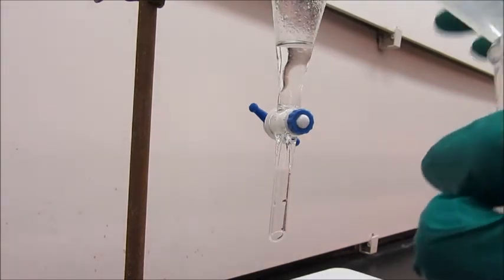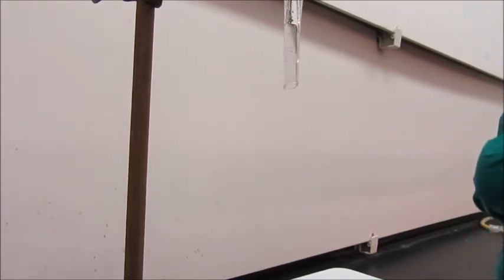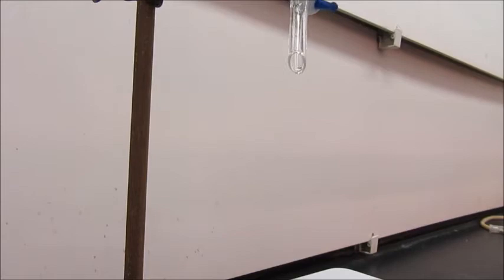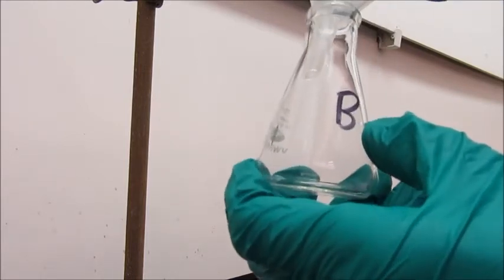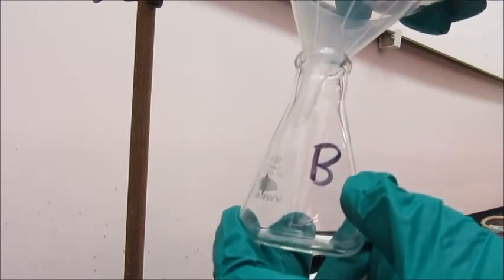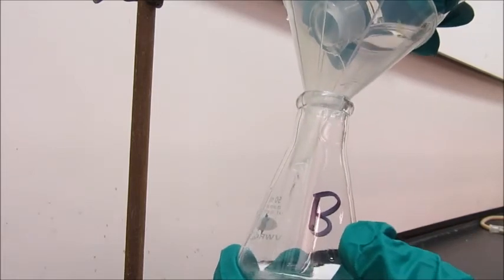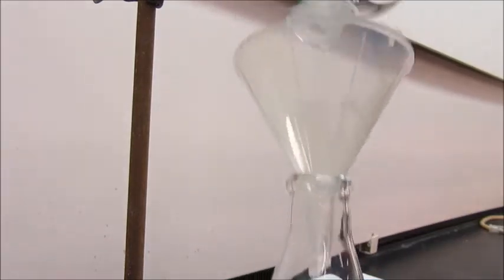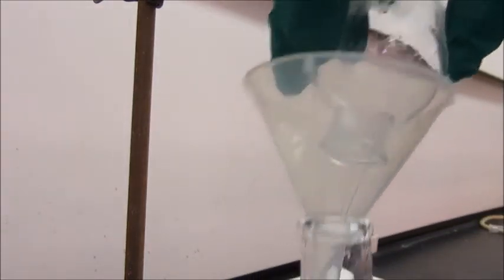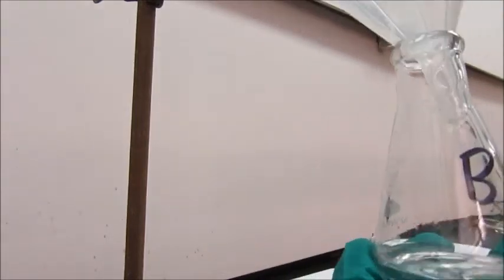And now I'm going to put the residual, the top layer, if I can get it out. I'll put the top layer into flask B. So I just have the separating funnel upside down there to tip it out.